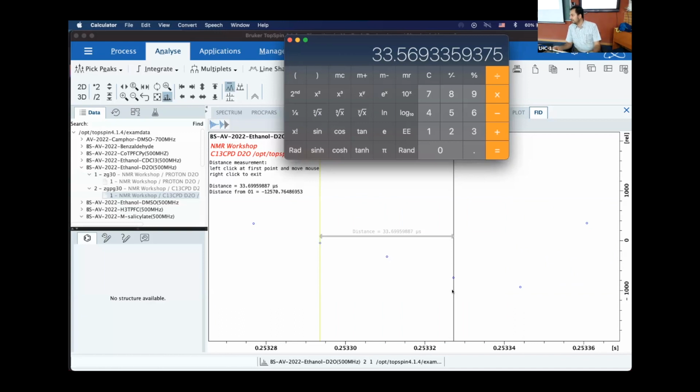Did that make sense? So basically, we are looking across various parameters: the NMR instrument, how you set up an experiment, the number of points that are acquired. As we said, the FID is not a continuous signal, it's digitized. Why am I taking the difference between leaving one point in the middle? Because half of the points are imaginary, half are real. We will understand why half are imaginary later on, although you do see it on the point. So don't worry about it.